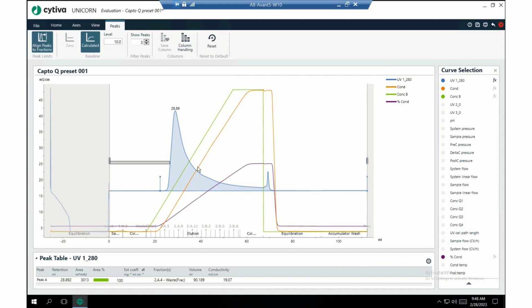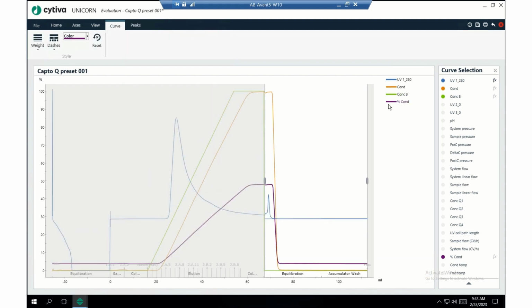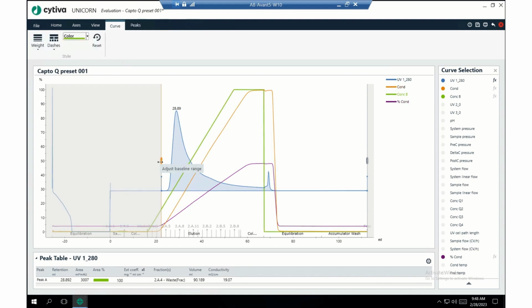Okay, so let's drag this over. Percent conductivity. See, doing this right on the fly isn't easy. So we'll just go with concentration and just kind of imagine what it looks like a few mil, like 1 CV later.